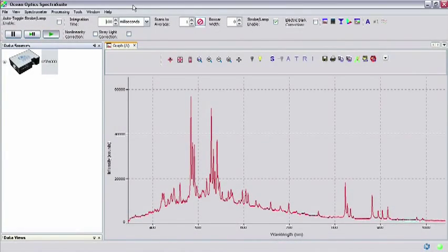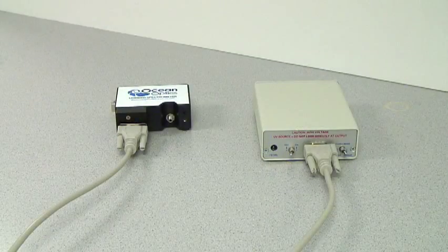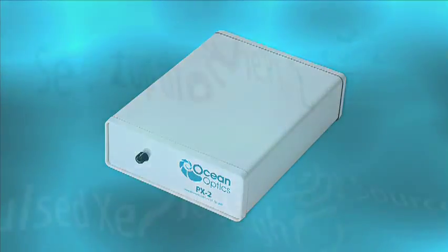To acquire quality data, you need stable, precisely triggered illumination. In this tutorial, we'll show you how to install and configure our PX2 pulsed Xenon light source.